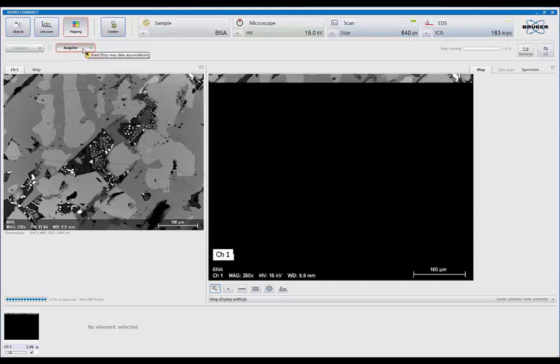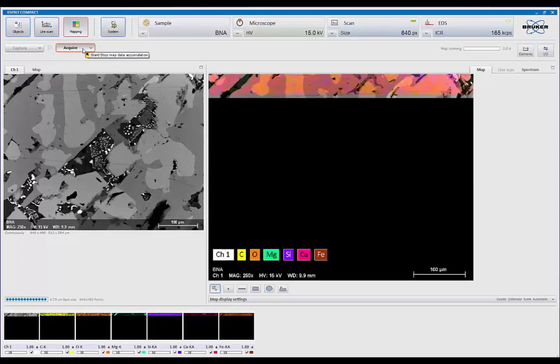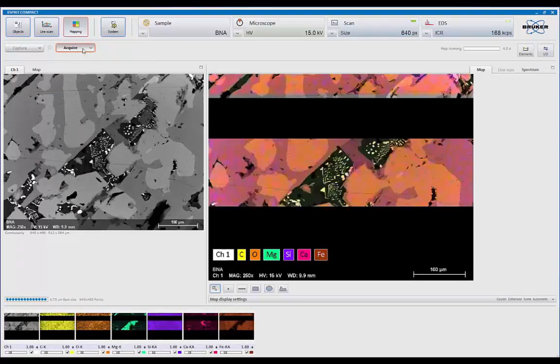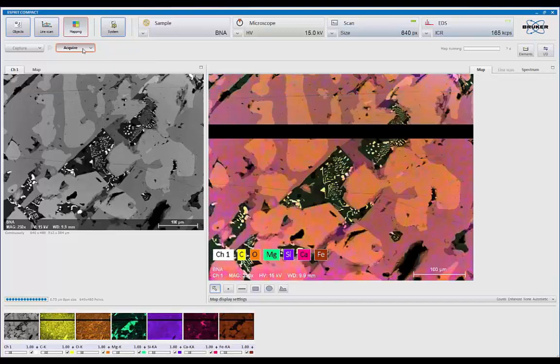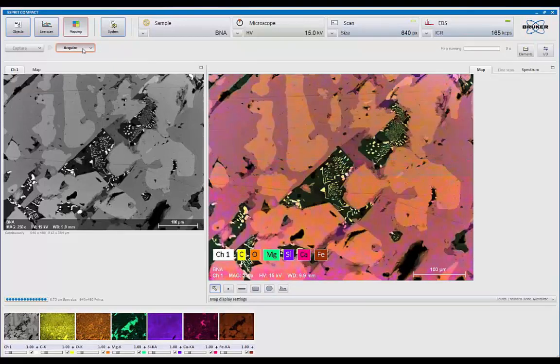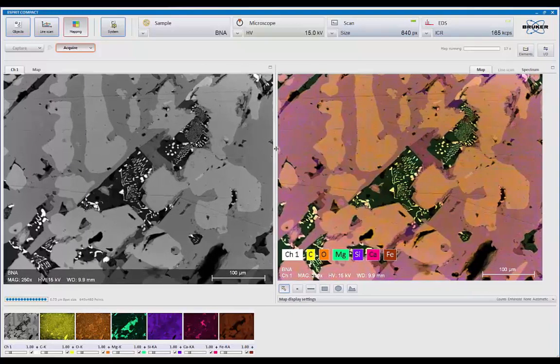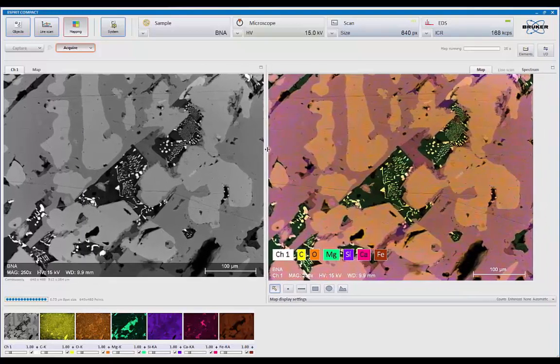Now, I haven't told it what elements to process, so it's going to look at the pulse stream and come up with its own list of elements to initially start. This works in hypermap mode, so in other words, we're collecting every single x-ray within the field. So we can call up any element at any time now, either during the collection or post-acquisition.